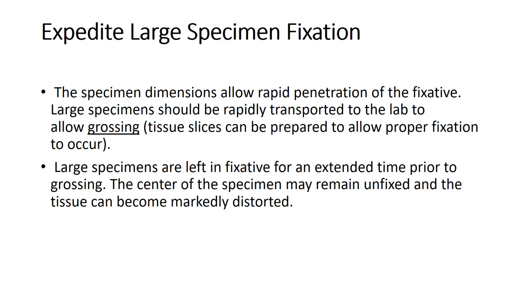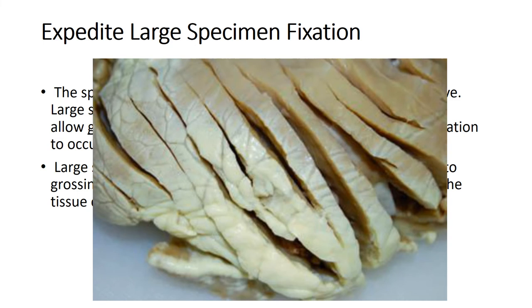Expedite large specimen fixation. The specimen's dimensions affect how rapidly fixative can penetrate. Large specimens should be rapidly transported to the lab. If left in fixative for an extended time before grossing, the center of the specimen may remain unfixed and tissue can become markedly distorted. To avoid this, large specimens should be book-sliced so fixative can penetrate into the deeper layers and reach the center of the tissue.